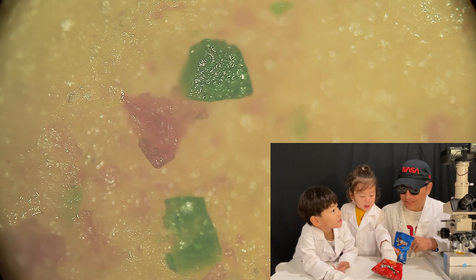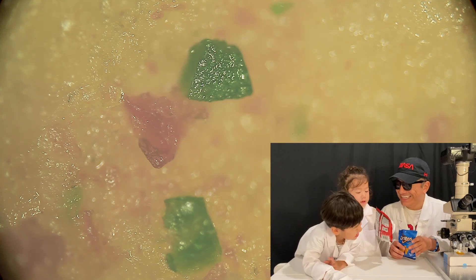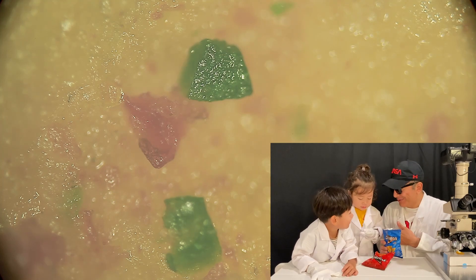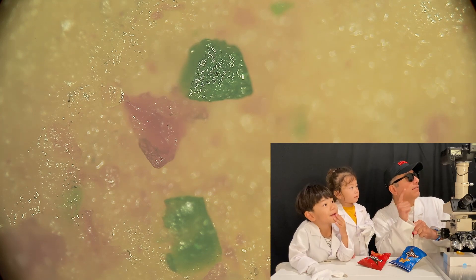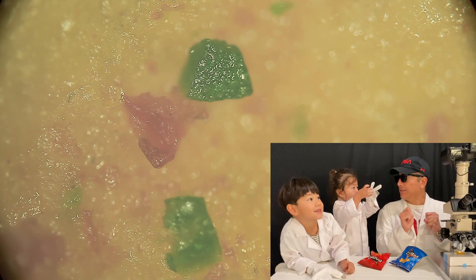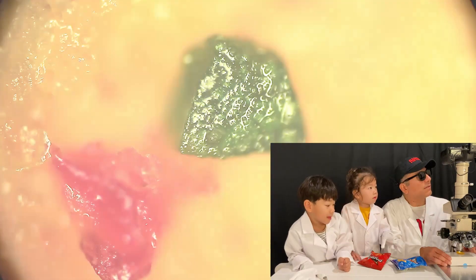Should we go a little bit closer? We should go to 10x. Let's focus in on that green sprinkle to see what it looks like. Here I go. That's what it looks like.